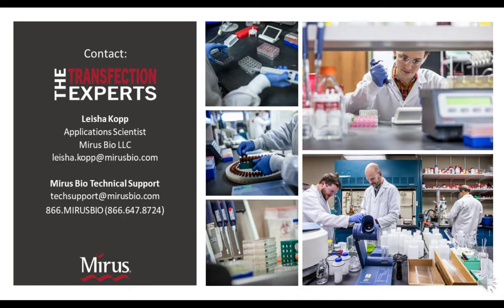And it looks like, okay, so the first question was, what do you consider the biggest hurdle for developing a large-scale viral vector production platform to be? And it looks like 50% of the audience cited that scalability or expression variability was the biggest hurdle. And that's something that we hear very commonly on our end, as well as troubleshooting with folks and helping them figure out how they can scale from the smaller formats to larger. The second most cited answer was cost of materials and labor, which is another huge concern and pain point that we hear. So that all makes perfect sense.